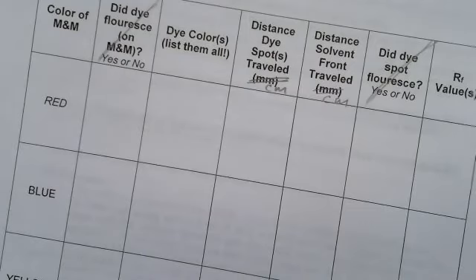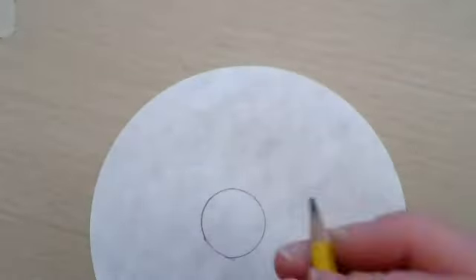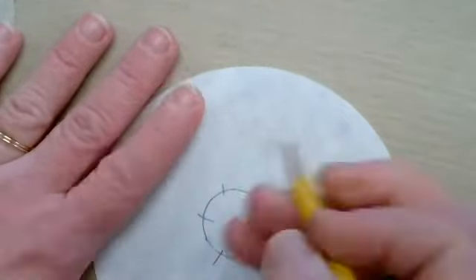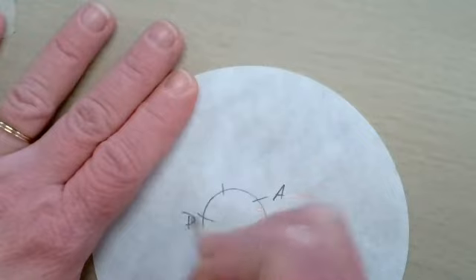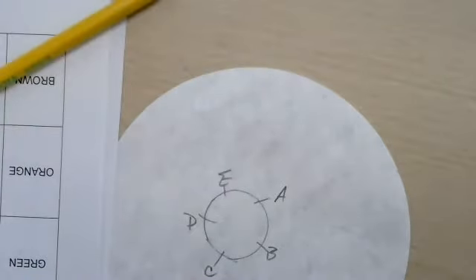So you take the quarter and trace around it. Then there are 5 different markers and pens. You're eyeing up about where the center is, totally fine. And then if we want to just equally space them, A, B, C, D, E, you can do it in any order that you want. The pens and markers are there and will remain there. Please, if you take them back to your stations, it's going to make it hard for everyone to do the work.